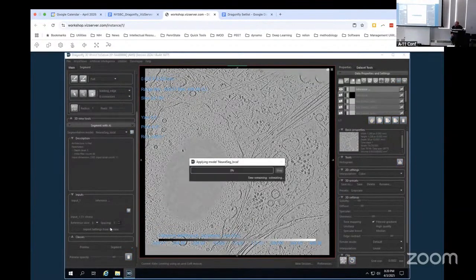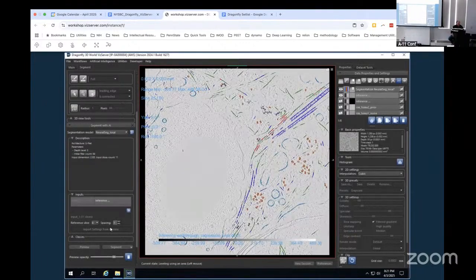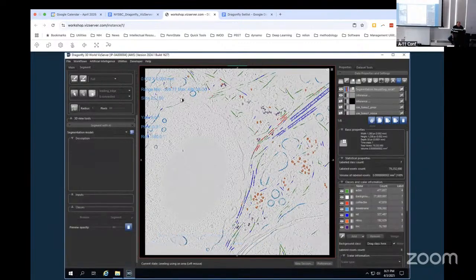Although this one was working really well beforehand, so it's not really a fair test, but if it sucks, then at least it says something. I mean, it doesn't look bad, but I don't know that it looks better.